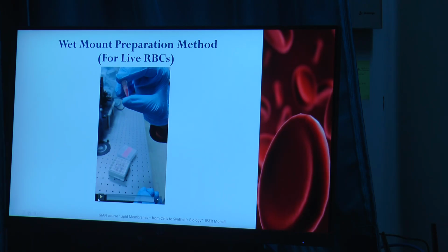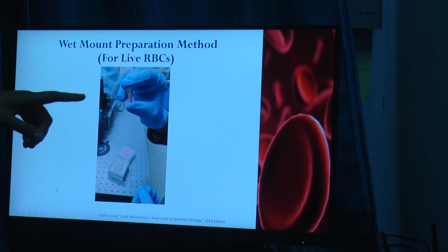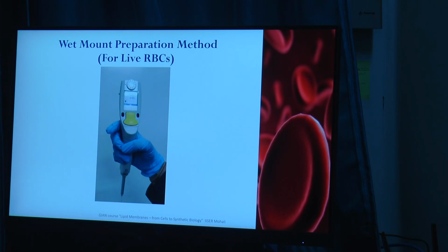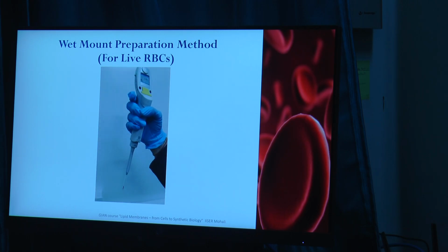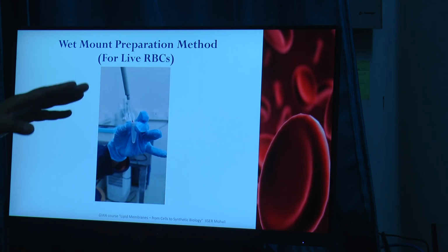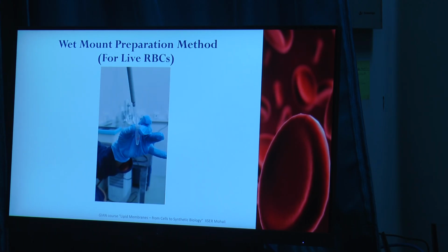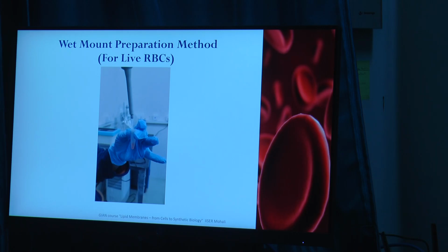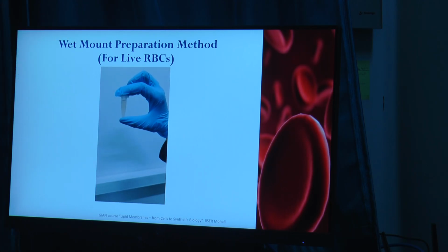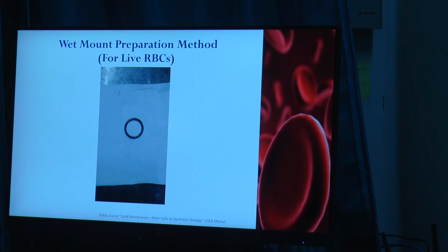So after doing the centrifugation, you will get the whole blood. Taking this whole blood, we are going to further dilute it in the PBS because we have a particular hematocrit level, but that still is going to be further diluted, and we are going to use that particular sample for our experiments. Why do we do this? Because first we fix the hematocrit level, and then we further dilute it into the sample with respect to the PBS for our experiment.